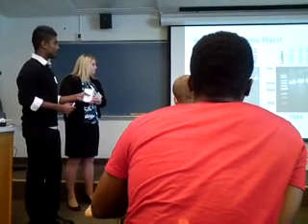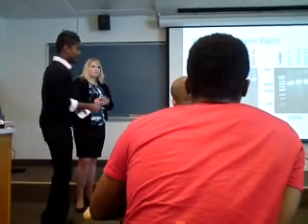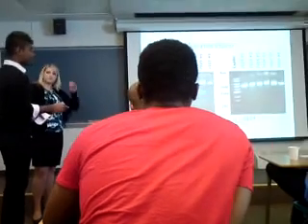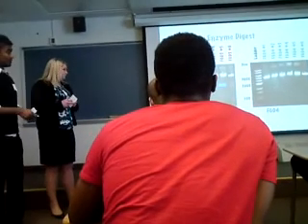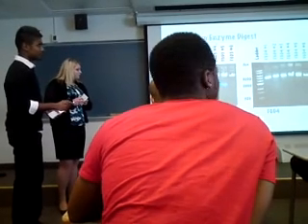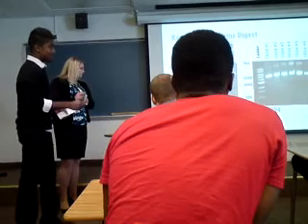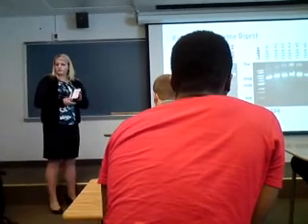If you look at FGD3, this arrow is indicating the recovered clone FGD3 sequence. Therefore, we conclude the result for FGD3 was successful. However, for FGD4, you don't see any band sizes for the FGD clone sequences. These bands are actually for the plasmid. Therefore, we conclude the results were unsuccessful for FGD4.